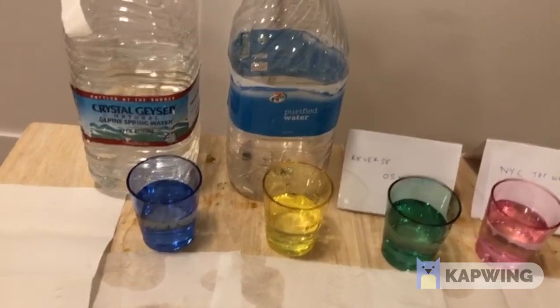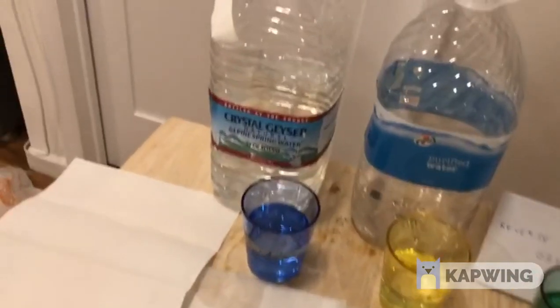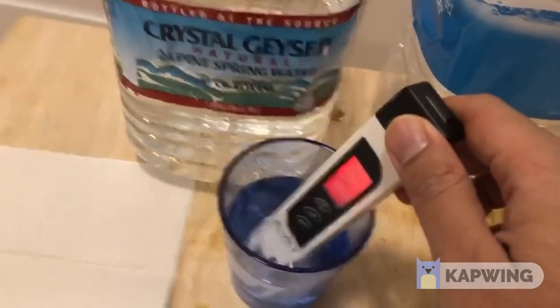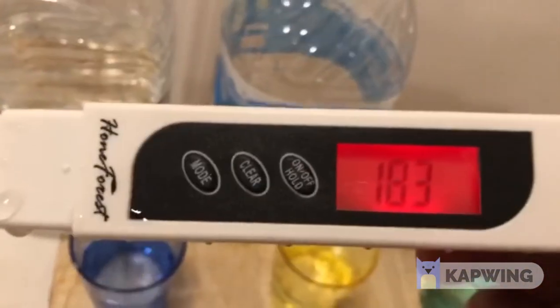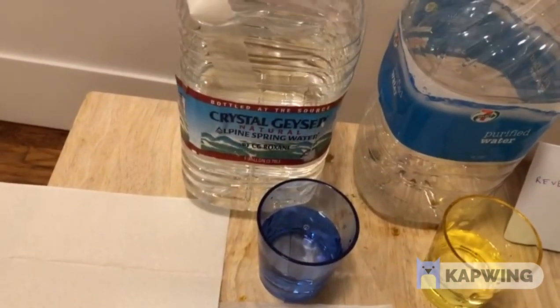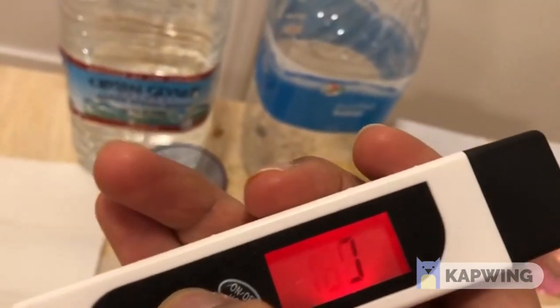So let us get started. I will first go and measure the Crystal Geyser water, which is supposedly very pure because it's water from the supermarket. I put the device in, shake it, and the value locks in — it's around 183 parts per million. Now this is actually very surprising because this was supposed to be pure spring water, but the parts per million is very high, and this is not good drinking water.